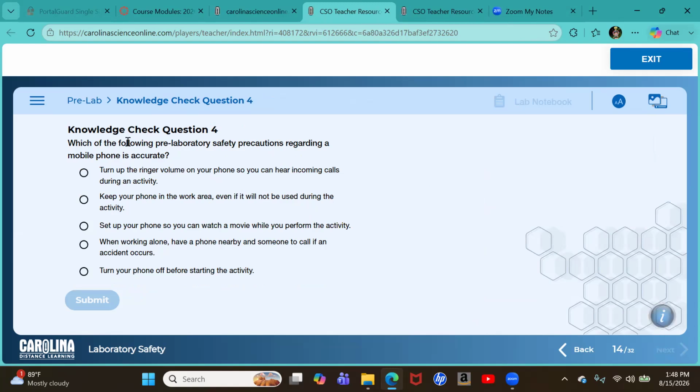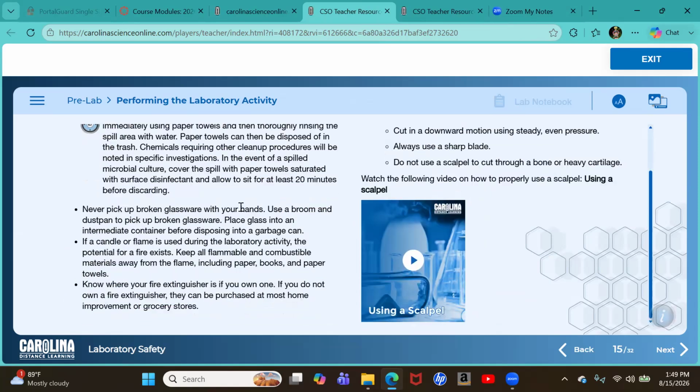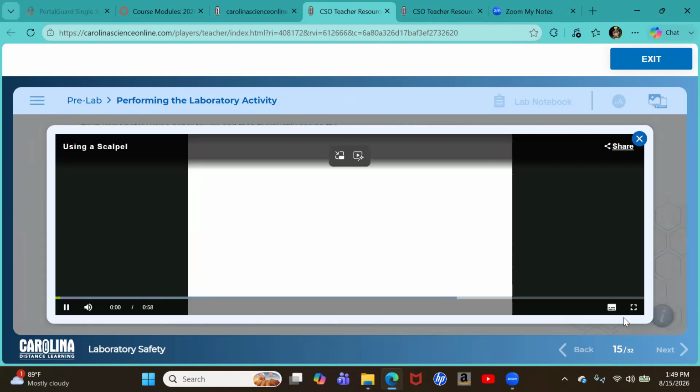Don't do that. So checkpoint question 4 here. When working alone, have a phone nearby to call in case you do have an accident, but make sure that phone is on silent or vibrate so that you can have your undivided attention to the lab. When you are performing lab activities, we will be using a scalpel to actually dissect your cow eye and your sheep brain. So you will have a scalpel that comes in your kit. So we'll watch this video on how to use the scalpel that you will have in your kit.